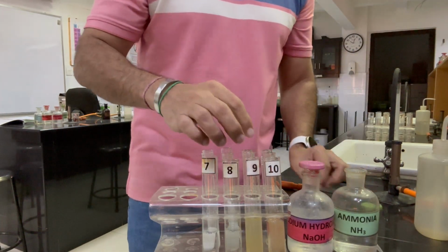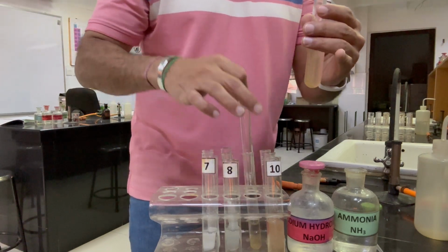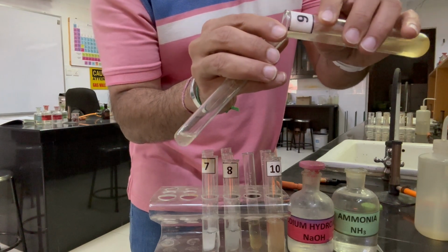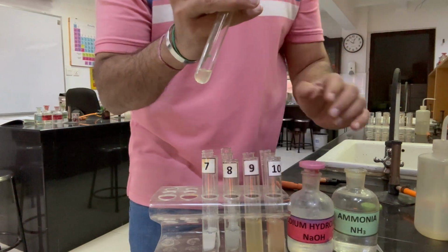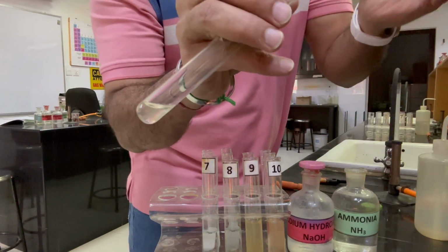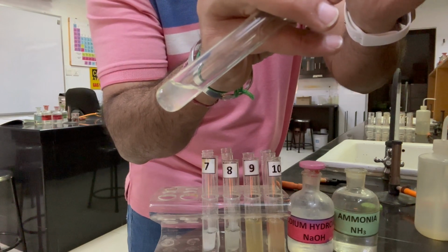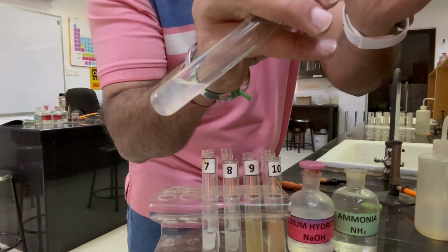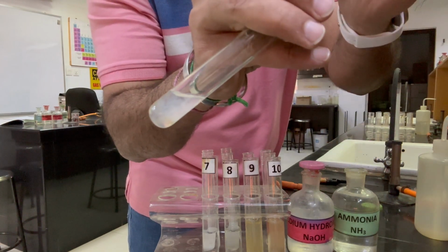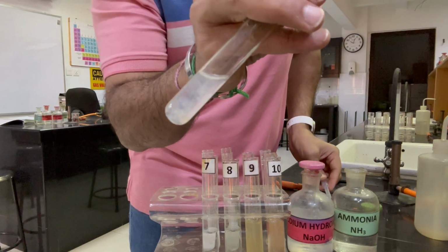Now take 1 centimeter depth of Fa9 and the same aqueous ammonia. Few drops first. White precipitates start forming, and if we add an excess, those white precipitates are not dissolving.